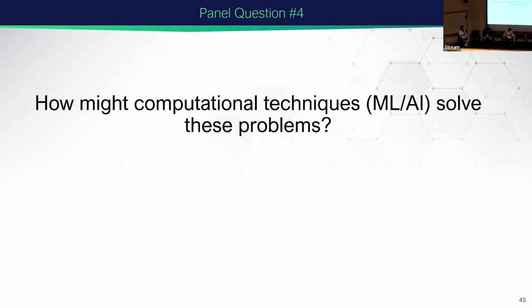But at the moment, people are just throwing data into the machine learning algorithms, and what happens is the program will pick out whatever the most abundant changes are, which may not represent much about specific biology. Maybe the molecule of interest might be very small, tiny peaks, and then the fluctuation of those peaks in spatial dimensions. Maybe the machine learning programs or any clustering program may not pick out those changes.